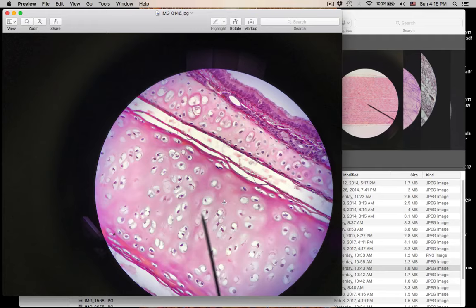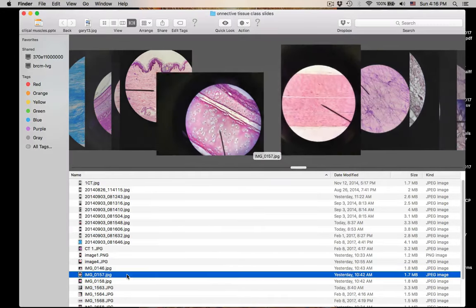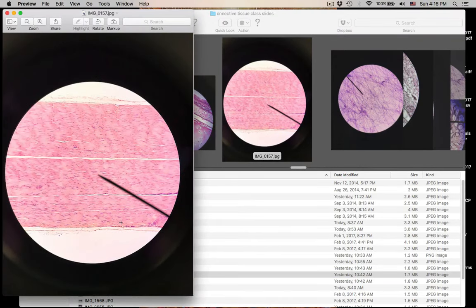Number fourteen is hyaline cartilage. Where do you find hyaline cartilage? It's the most common cartilage. This is actually from the trachea — you can see pseudostratified ciliated columnar epithelium facing the lumen. You also find hyaline cartilage covering the ends of long bones, the costal cartilage of the ribs, and the nose. Remember cartilage is avascular and very slow to heal.